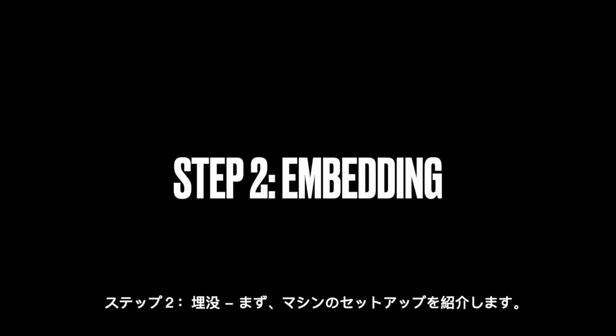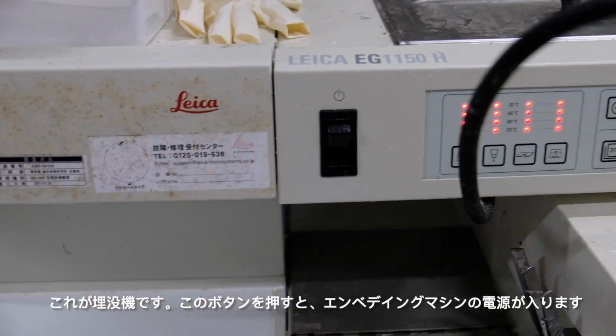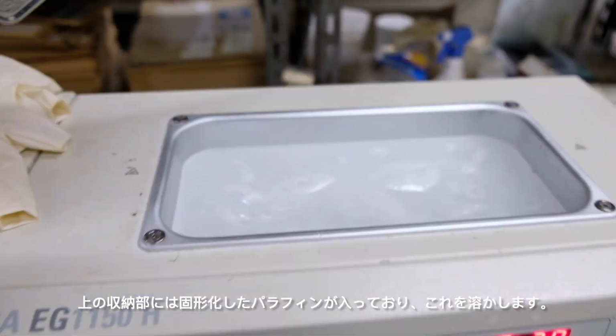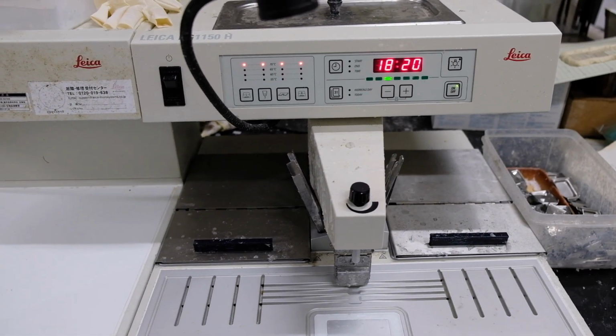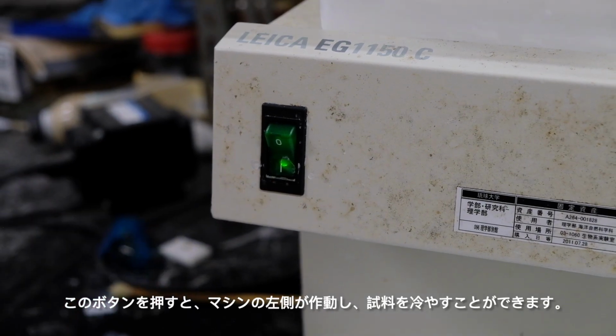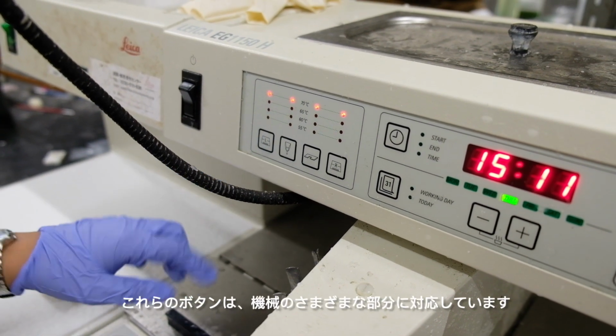So the next part is embedding, and first we'll show you how the machine is set up. So this is the embedding machine. Press that button to turn it on, and the top compartment has solidified paraffin that will melt. That also has paraffin. Pushing this button will turn on the left side of the machine, which will keep the samples cool. These buttons correspond to the different parts.